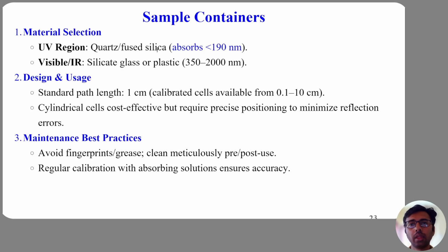Let us review essential laboratory practices. Never touch optical faces with the fingers. Remove grease and fingerprints immediately. Clean before and after every measurement. Never heat to dry cuvettes. Allow natural air drying only. Periodically calibrate using standard solutions. Always remember, in spectroscopy, small optical imperfections produce large analytical errors.